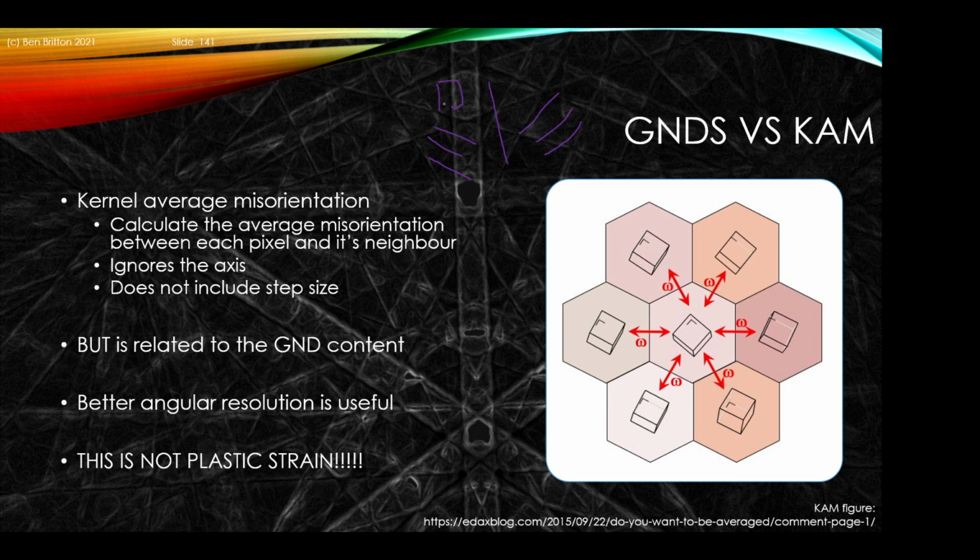If you then had your pixels measuring like this, you will see that effectively there is a misorientation angle, so delta theta over here, and delta theta on this side. And so the region where there effectively is that high array, just let me check. I think the dislocations, I'm probably going to get the sign wrong, but I'm going to suggest they're this way around. I may be wrong.